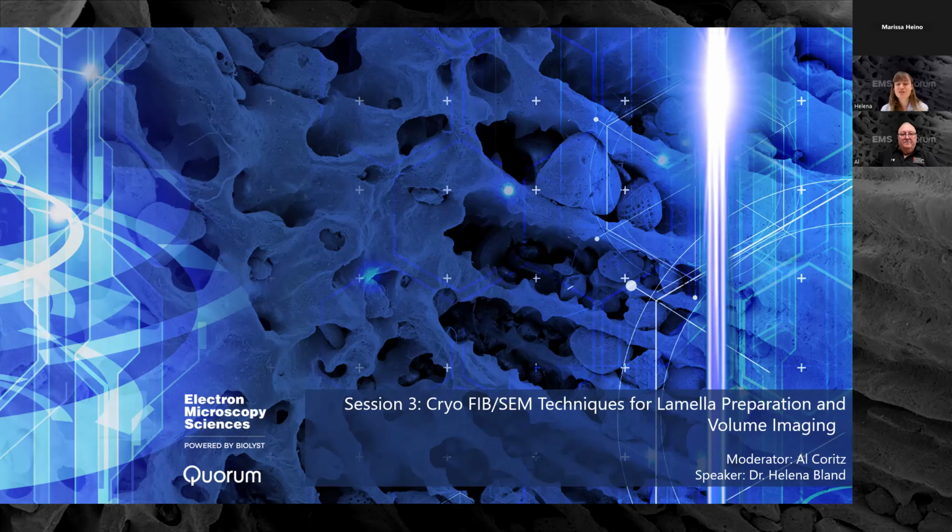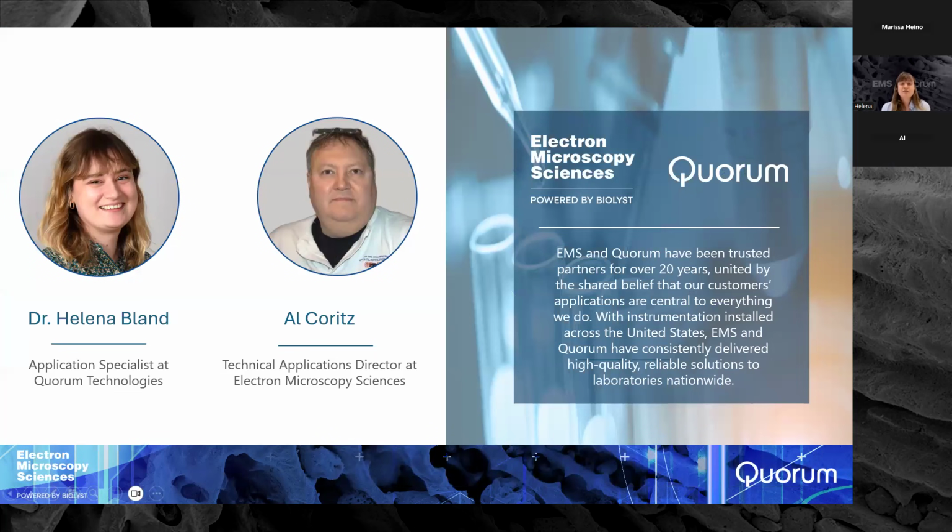As Al just mentioned, this is our third in our 3-part series on electron microscopy sample preparation techniques. Today we're going to be talking about cryo-FIB-SEM techniques for lamella preparation and volume imaging. EMS and Quorum have been working together for over 20 years, and we are specialists in electron microscopy sample preparation.